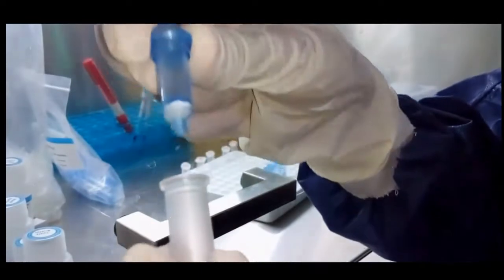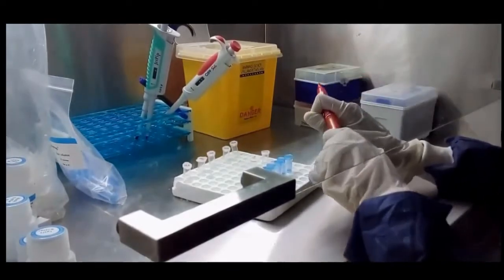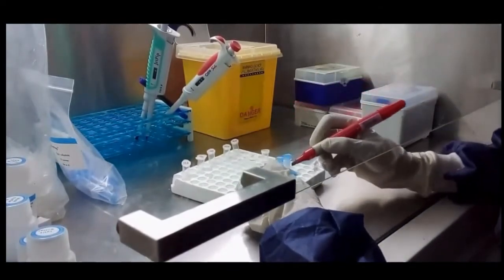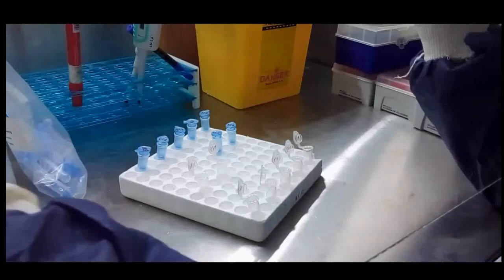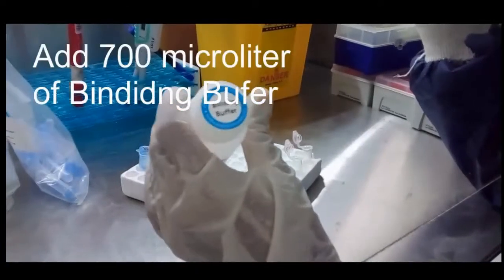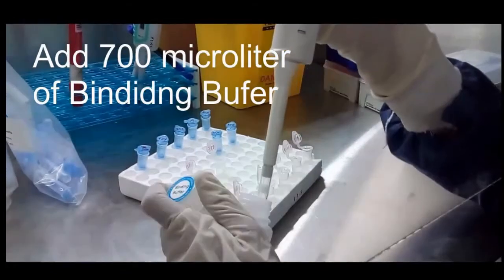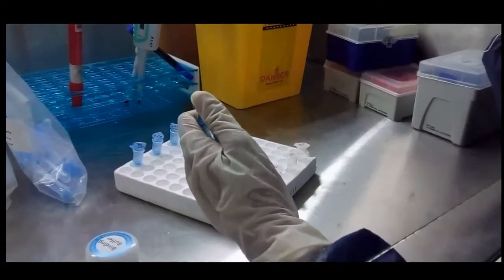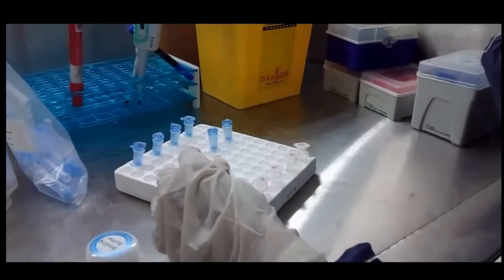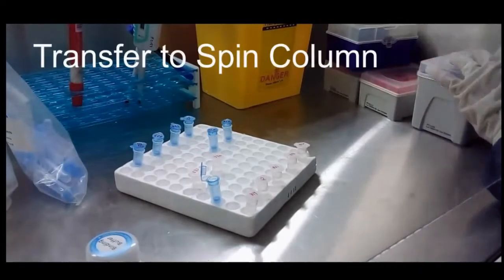Here is the spin column containing silica. Label the spin column. Add 700 microliters of binding buffer. Transfer the mixed solution to the spin column.